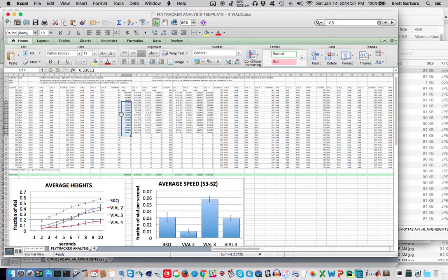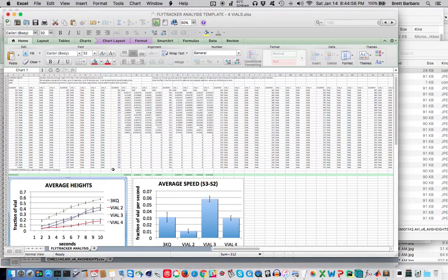And if there's no data after that point, then when it does the averaging across, it'll treat that as 0. And that will not be a good thing for your averages. Those will then be inaccurate averages at 7, 8, 9 seconds like that. So you definitely want to make sure that you have data for all of the seconds that you're trying to show here on the chart.